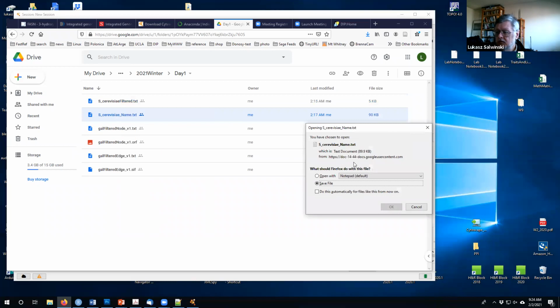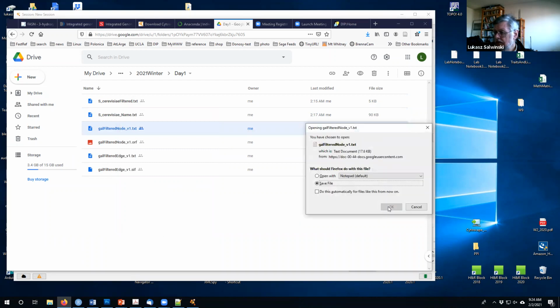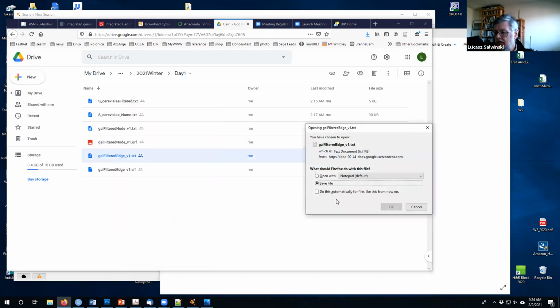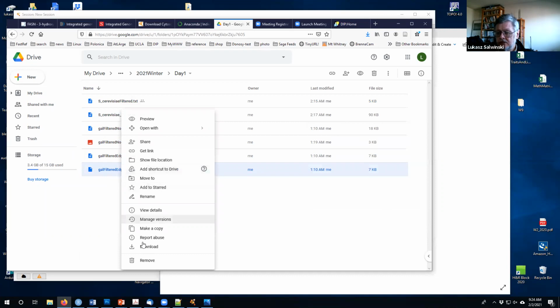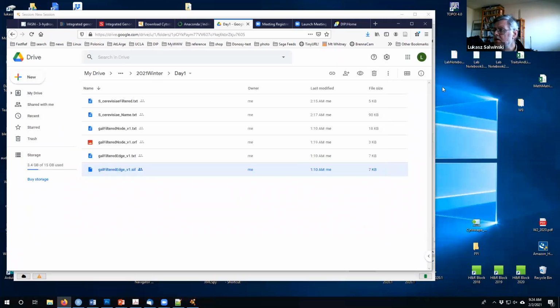I'm just saving all those files one by one. Okay, and save, and save, and save. Okay, something happened. I don't want this one.